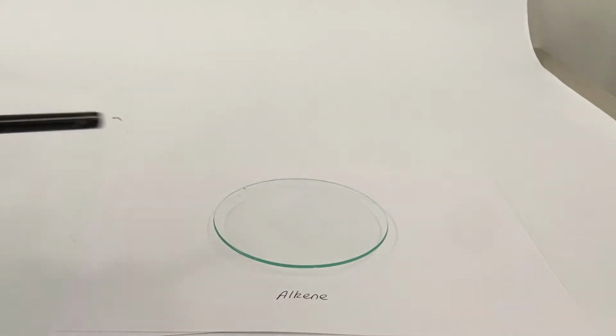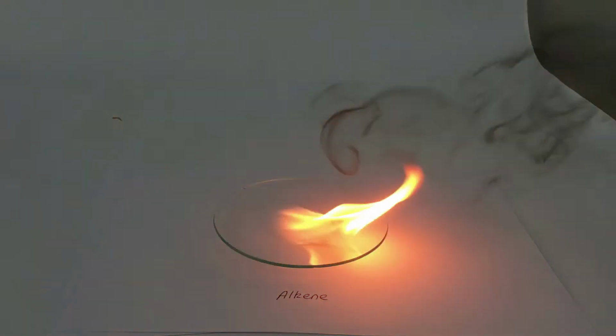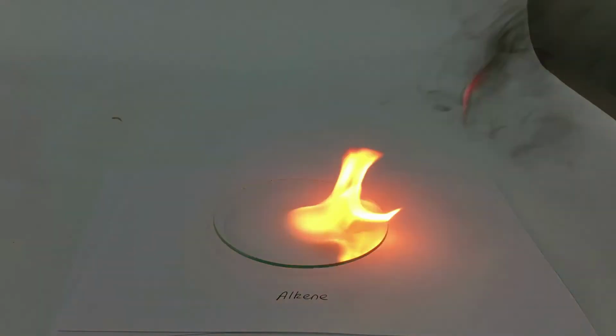Okay, and here we have the alkene. So not unlike the alkane. Still a lot of that dark smoke coming off it.